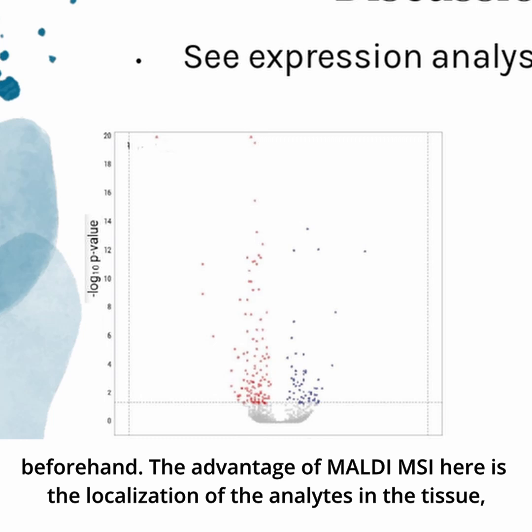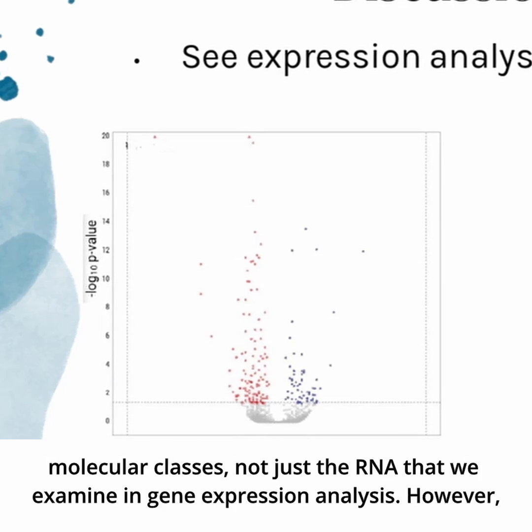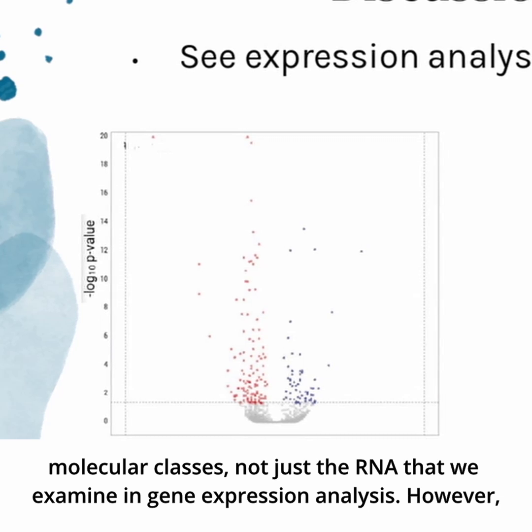The advantage of MALDI MSI here is the localization of the analytes in the tissue, which we do not have in gene expression analysis. At the same time, MALDI MSI can examine many molecular classes, not just the RNA that we examine in gene expression analysis.